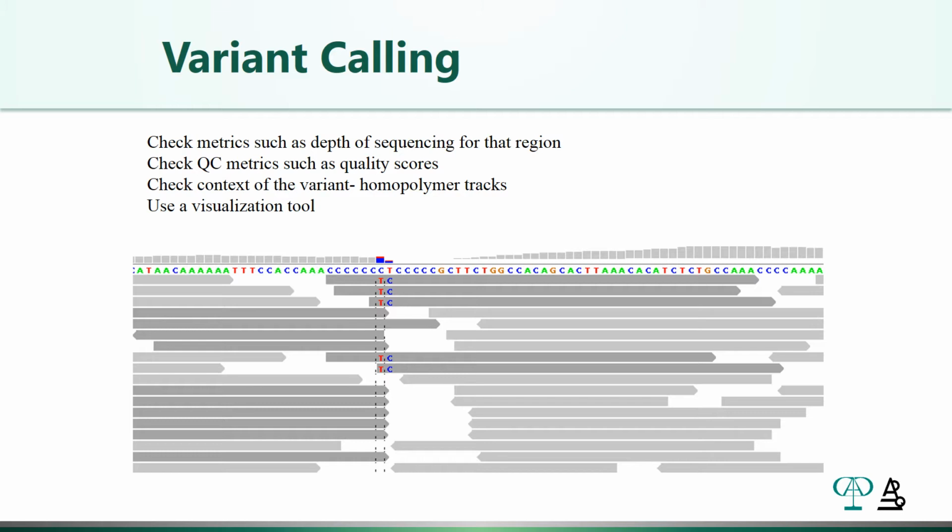It only happens in the one direction, and it only happens in one kind of amplicon. And so you would probably want to go in and look at this again in a second sample to make sure that this is actually real, which in this case it probably is not.